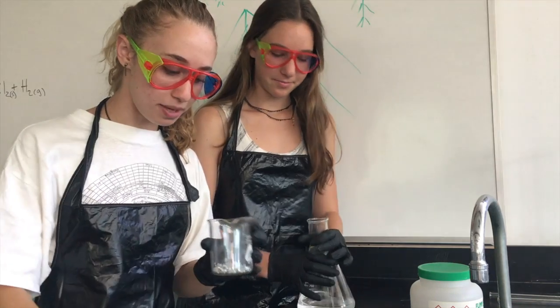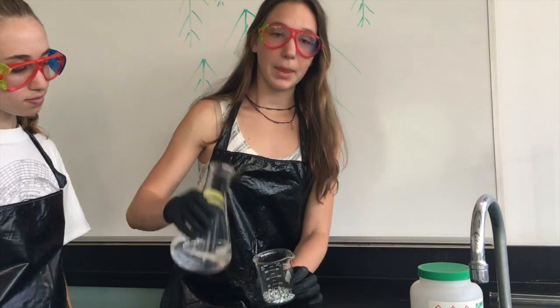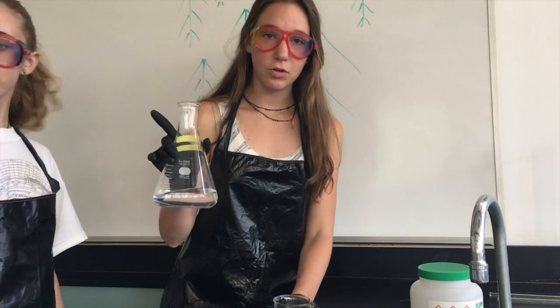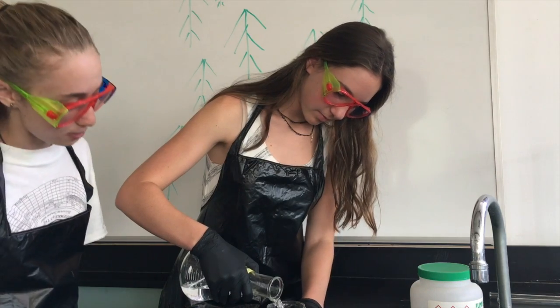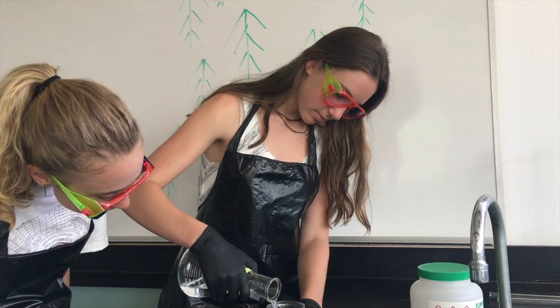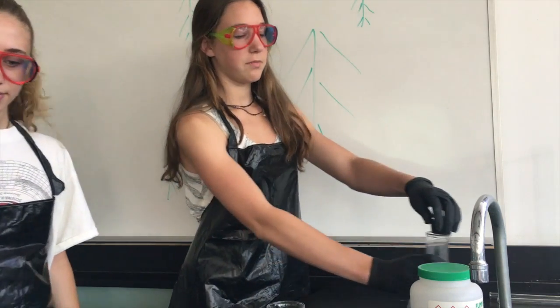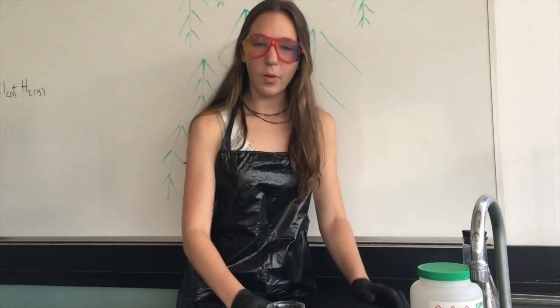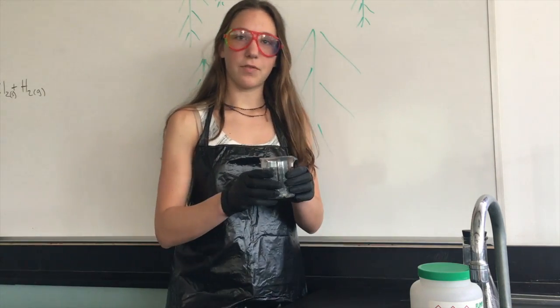And we pick some small pieces so that it reacts more quickly. Now we're going to pour 200 milliliters of tin 2 chloride hydrochloric acid. It's 0.5 molar as well. There we go. 200 milliliters. Now we will wait until it gets mossy and rises to the surface.